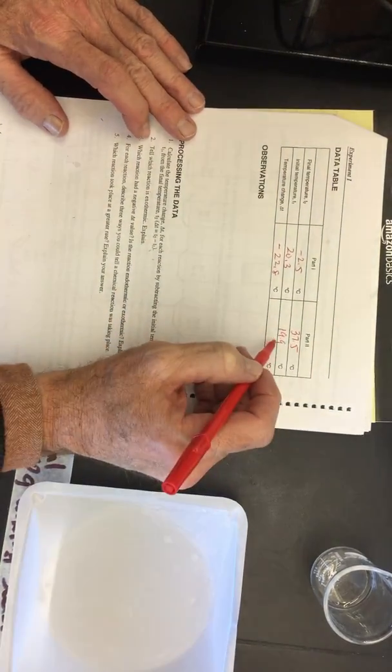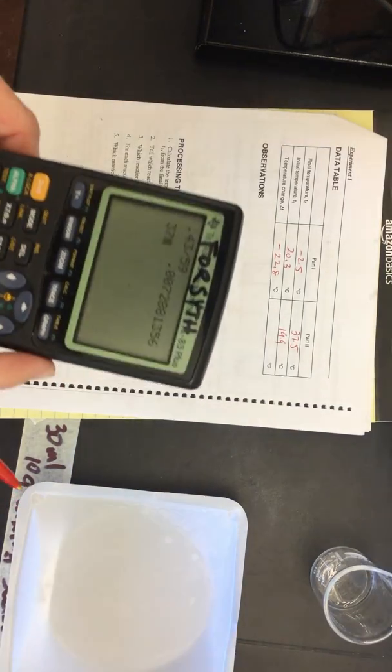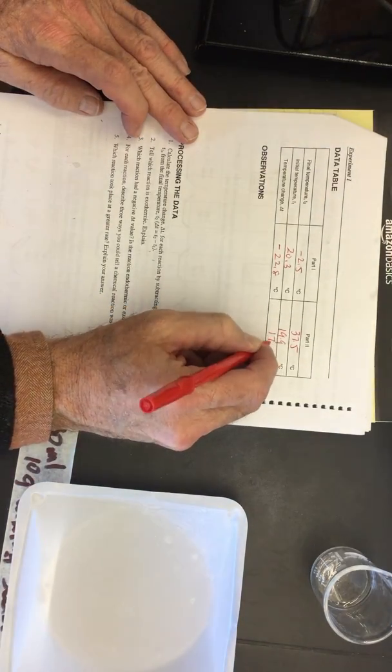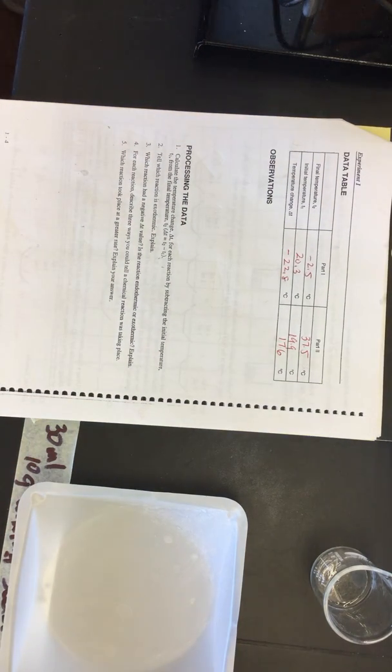So we're taking this minus this, and let's get my calculator. We have 37.5 minus 19.9. That gives us 17.6. So that's the result. Let me go ahead and print this off. And we can use these as comparison.